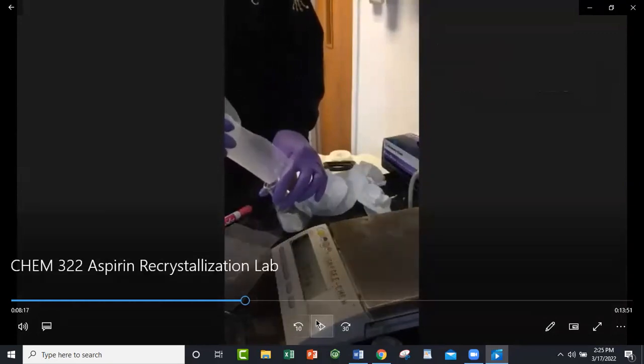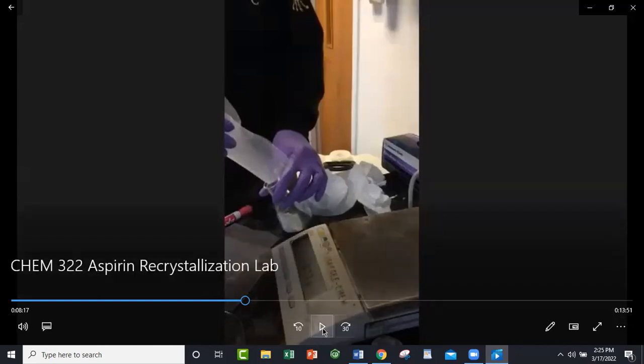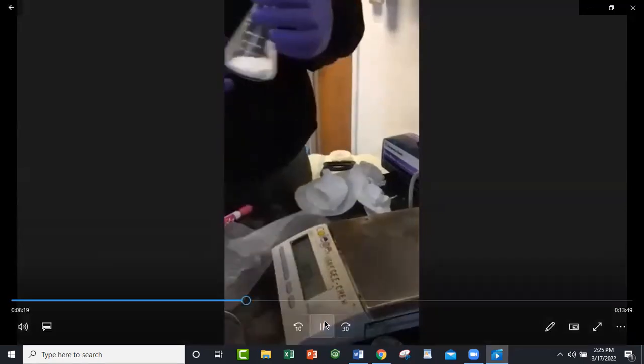And if you're wondering about the amount of the aspirin that's going to be recrystallized, it's always all of it. The only time you save any of that crude sample is to take a melting point or do some other analytical test. Other than that, you want to recrystallize as much of it as possible because you want your yield to be as high as possible. All right. So, 7.2 grams.